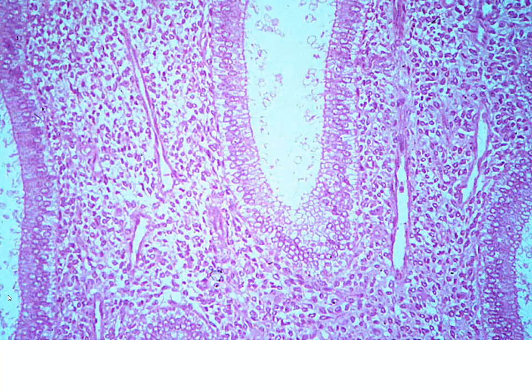Here we're looking at the base of a uterine gland, and we can see that now we have fairly long longitudinal sections through blood vessels. This is going to tell us we're getting down toward the basal layer, and these are the straight portions of our arteries and veins present in the endometrium.